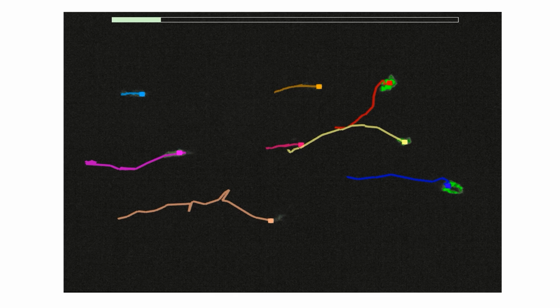To study these trajectories, the first step is to smooth them. When macrophages move toward the wound, we distinguish their motion into two parts, drift and diffusion. While moving, they are attracted by the chemoattractant gradient. This is the drift part or the active part of motion. On the other side, the part of motion not related to the chemoattractant gradient is called the passive part or diffusion motion. Smoothing the trajectories allows us to distinguish between these two parts and study them separately.